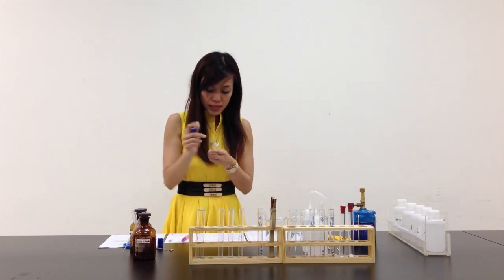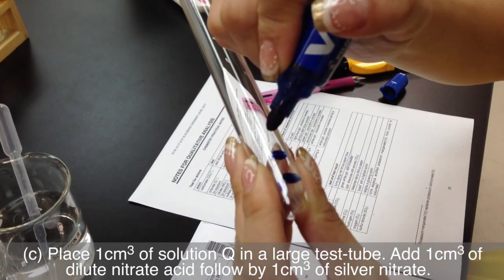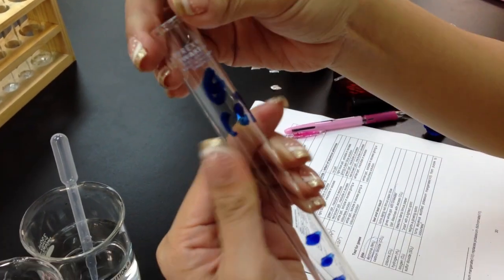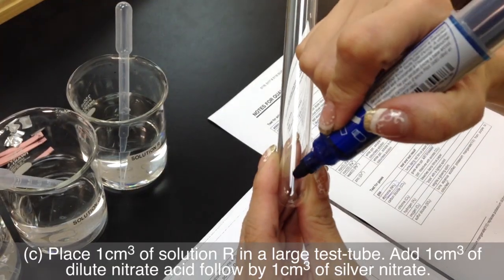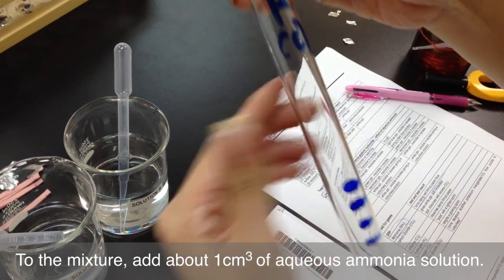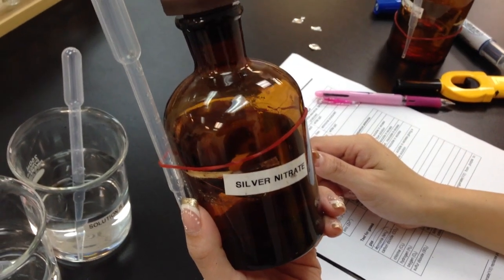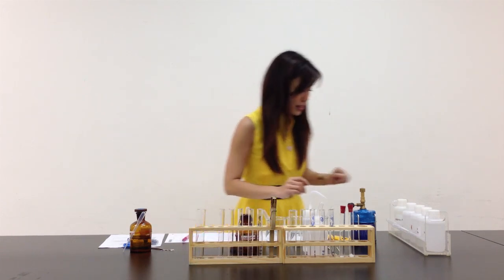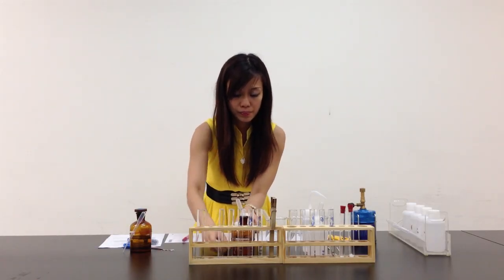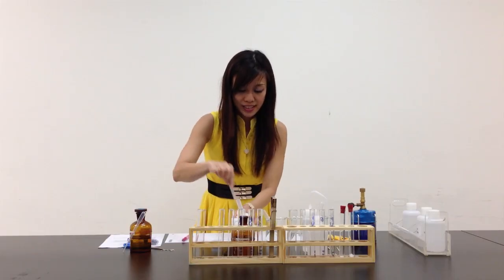For Q, Part C: 1 cm³ of Q, 1 cm³ of dilute nitric acid, 1 cm³ of silver nitrate, and 1 cm³ of aqueous ammonia — 4 lines. For R, Part C: 1 cm³ of R, 1 cm³ of dilute nitric acid, 1 cm³ of silver nitrate, and 1 cm³ of aqueous ammonia. Now let me prepare the solutions — silver nitrate is here, nitric acid is here with the pipette, and aqueous ammonia is ready.